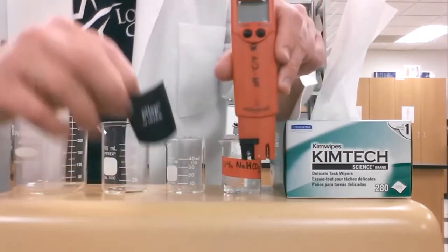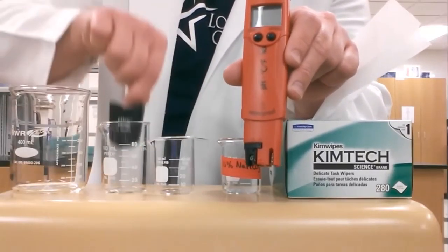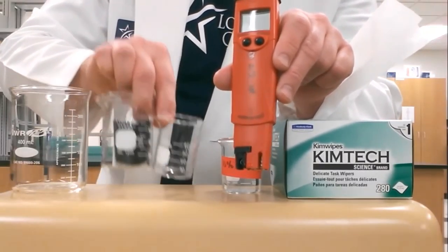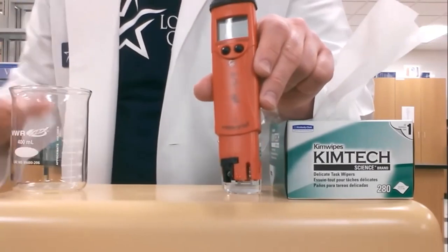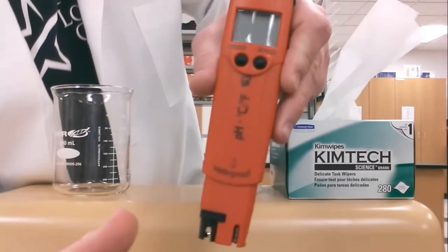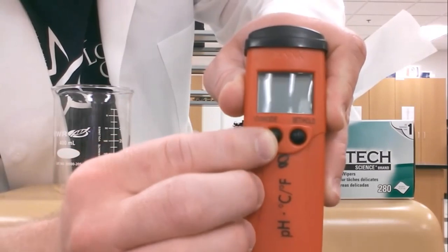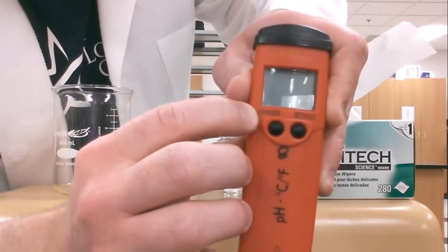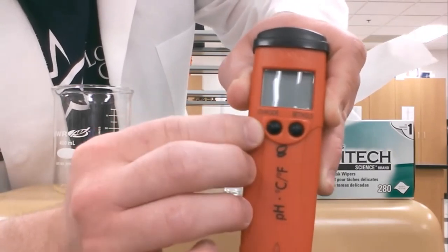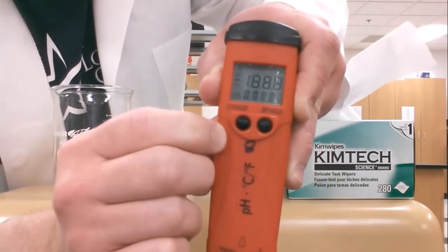So this cap I'm going to either put into the 50 ml beaker or the 100 ml beaker, and that's going to help me keep from losing this thing. So once we set that aside, we're ready to go. We're going to turn on the pH meter by holding down the power button. It has a circle with a small line through it, which most power buttons usually have, and the word mode next to it. So we're going to hold that button down for a full second. There we go.